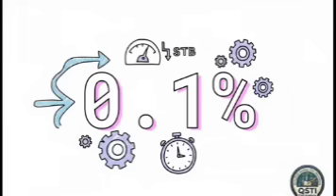While that pure nitrogen is flowing in, you absolutely must keep your eyes on the O2 STB. That's the stability reading on your display. You are waiting for that reading to fall below 0.1%. As the manual explicitly warns, this is a milestone that might actually take several minutes to reach. The analyzer is in the background actively calculating the stability of the measurement, and you literally cannot proceed until it confidently drops below that tiny fraction of a percent.